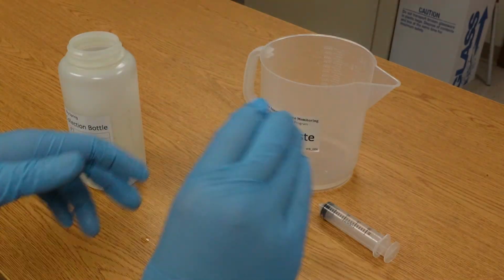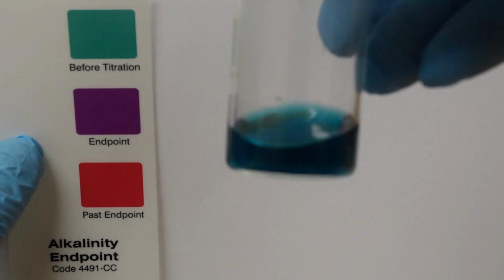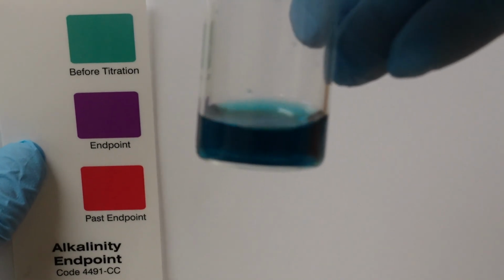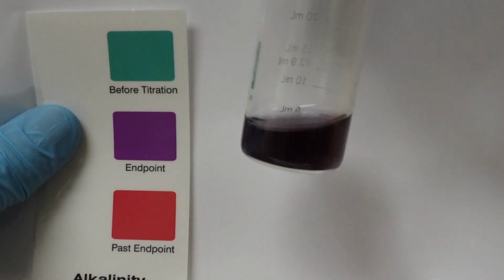Note that your solution may be a darker shade than shown on the color chart, but you are looking for a distinct change from blue-green to purple. To help see the color clearly, looking at the solution with a blank white background and in good light will help.